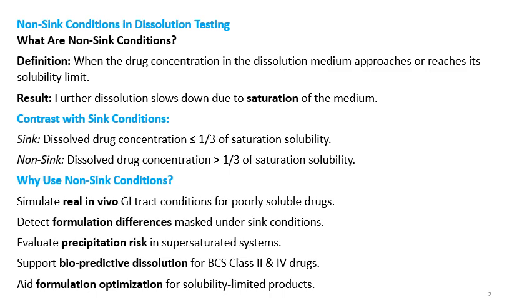Non-sink conditions can detect formulation differences masked under the sink conditions. They can also help you evaluate the precipitation risk in supersaturated systems, support biopredictive dissolution for BCS class 2 and 4 drugs, and help in formulation optimization for solubility-limited products. So you can consider it as a worst case scenario for your dissolution testing and screening of the formulations.